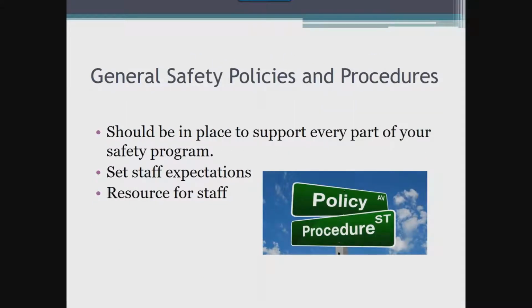Your chemical hygiene plan may be one very large document, or if you feel it might be easier to address the various key components in separate documents, that is also acceptable. Sometimes when policies get too large, they are hard to use as resources, so they are broken down into several smaller documents so that they are more manageable and easier to reference.